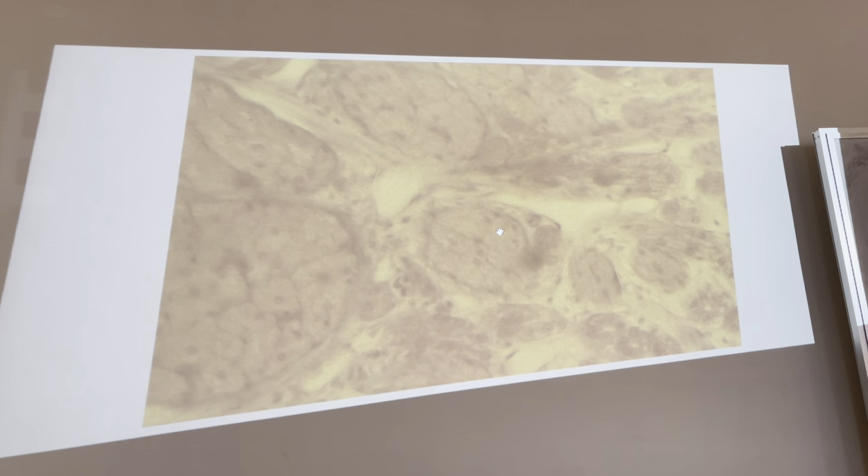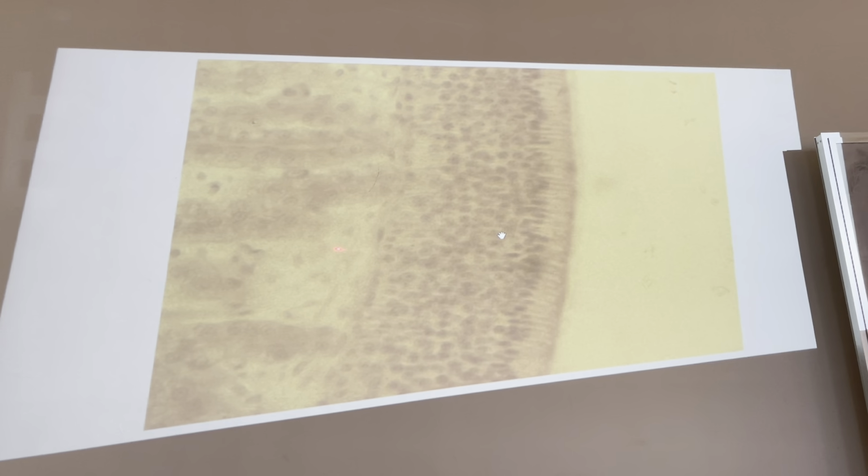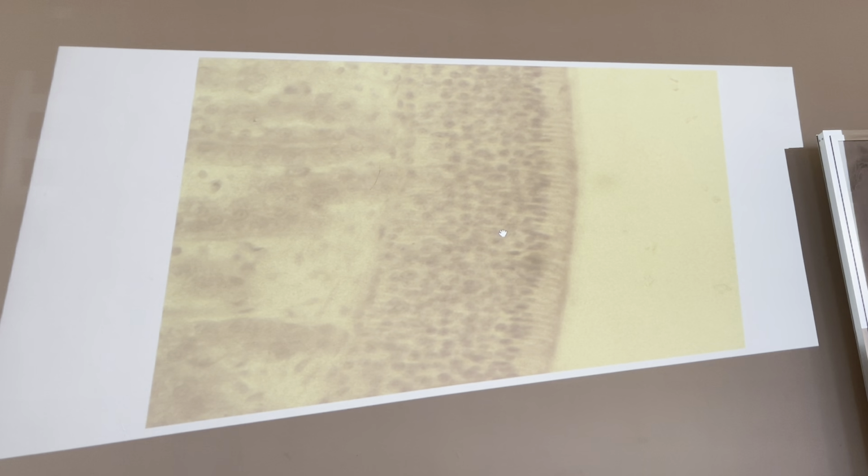But more than this, it's important to see some special cells. Take a look at this hairy structure, which is called the olfactory hair, and this is the apical cell, which is called the supporting cell, and this is the olfactory bipolar neuron cell, and this is the basal stem cell. Do you have any questions so far about the olfactory epithelium?